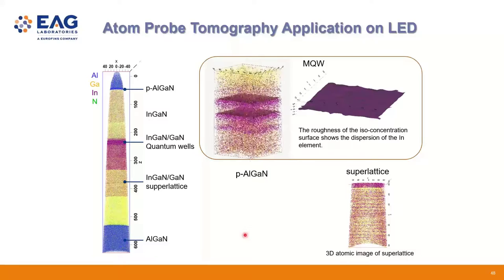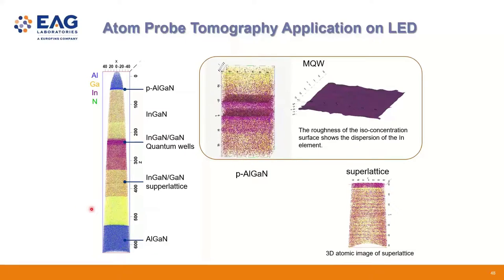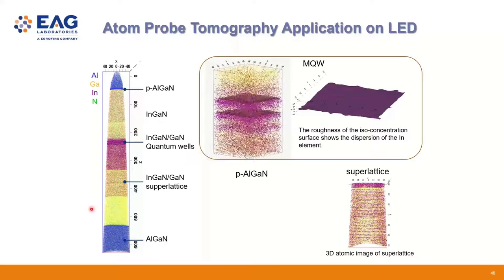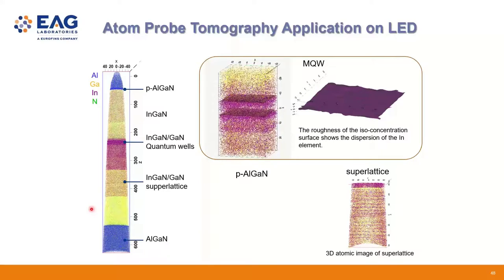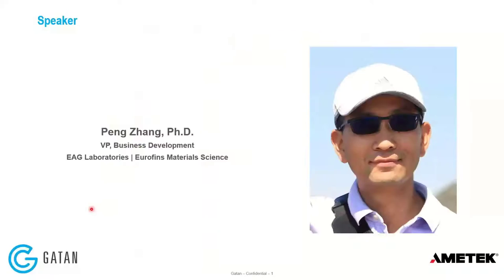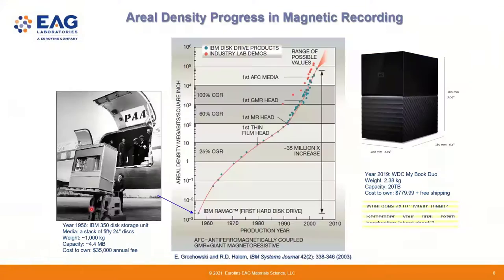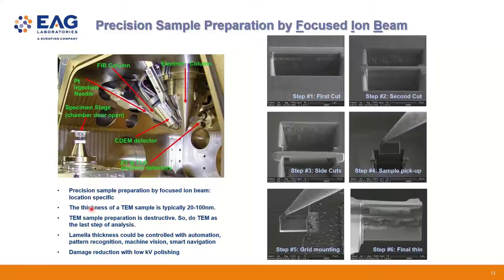Cool. Okay, thanks. And then a question that came in right at the beginning that I forgot to ask yet was about the sample. Again, it's a sample prep related question, so the link's quite good. Can we use the FIB to prepare insulating samples, and is there anything that we need to be especially careful about when preparing cross-section samples with the FIB?